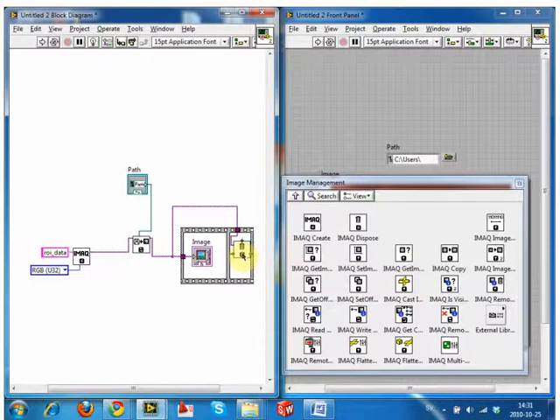Well, no, what we need to do is put it into a loop so that it will display the image while we're working, and then once we stop working, destroy the image. Kind of a stop button. Yeah, but we need to have a stop button, we need to be in a loop. We need to be actioning something. Right now, it executes once and once only.